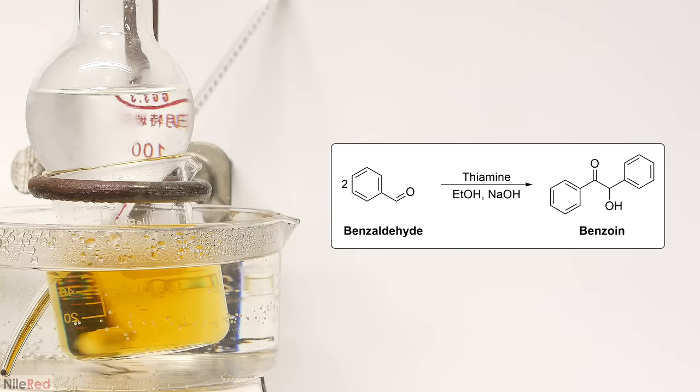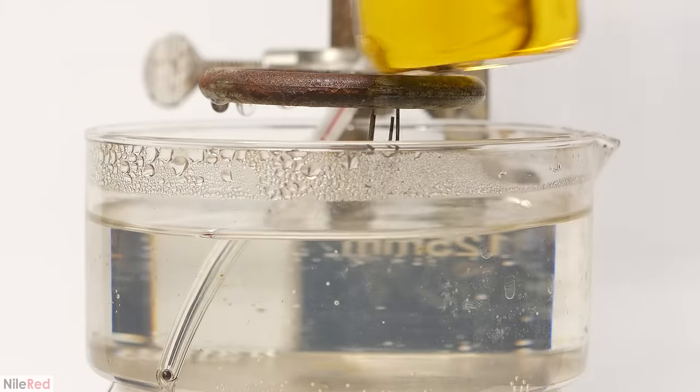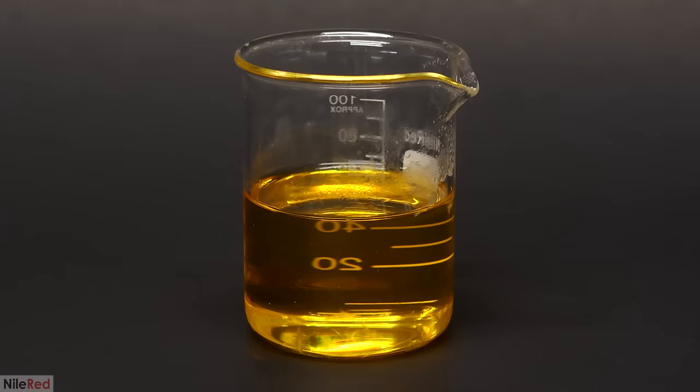As I mentioned earlier, bitter almond oil is almost entirely made of benzaldehyde. And under these conditions, in the presence of the thiamine catalyst, two benzaldehyde molecules will condense together to form benzoin. I left it in the water bath for about 90 minutes, and then I took it out and let it cool. As it cooled to room temperature, benzoin slowly crystallized out.